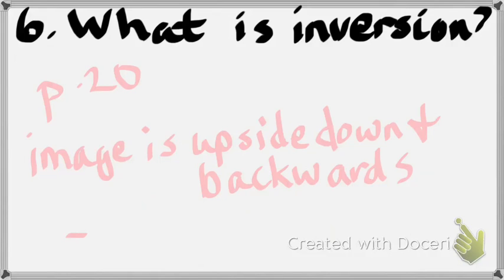So just pretend with me. You may remember we did the letter E that day. Okay, so I want you to draw in your notes the letter E inverted. I drew the regular letter E. Now you draw it how it would appear under the microscope. I want you to invert the letter E. Okay, and then check on the person at your table and see if they inverted it the same way you inverted it. Their E should look like your E. They'll check on each other.